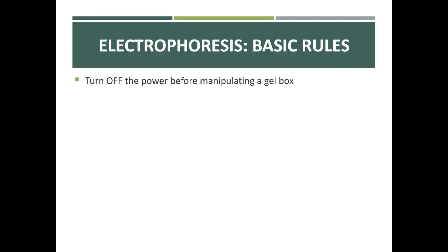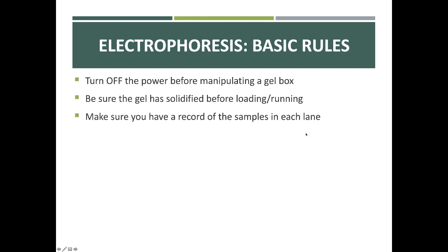Always turn off the box before you manipulate it in any way, before you add the buffer, before you add the gel, before you add the DNA. And then when you're done, turn it off before you take off the lid. You never want to have an accidental shock. Be sure the gel has solidified before adding the DNA samples. This is a common mistake that happens early on. You can really tell when it's done because initially it looks like water, very transparent, and then when it solidifies, it's very opaque.